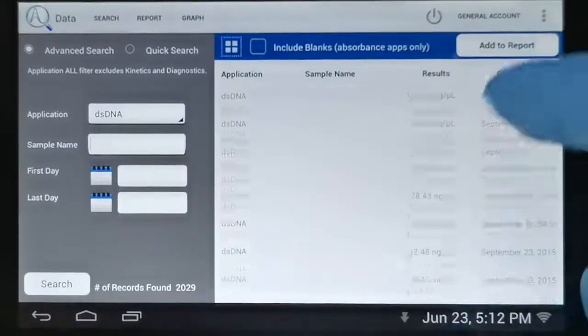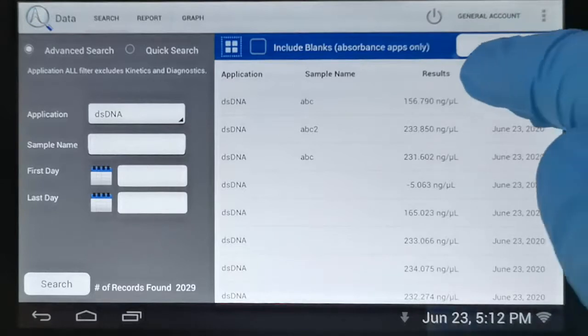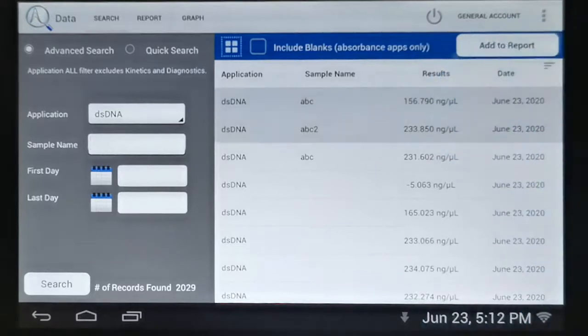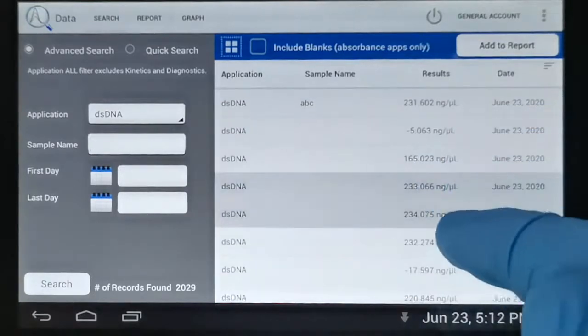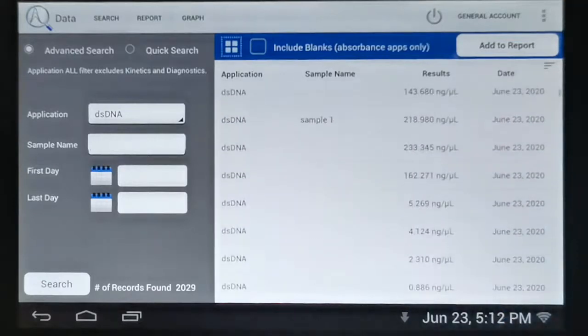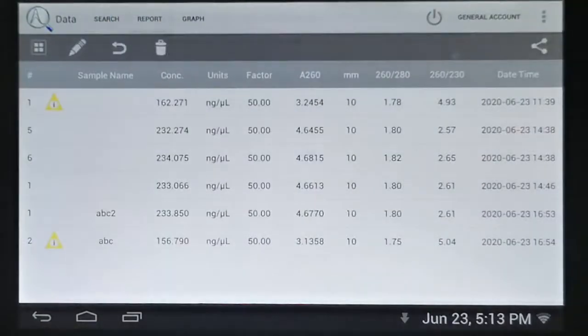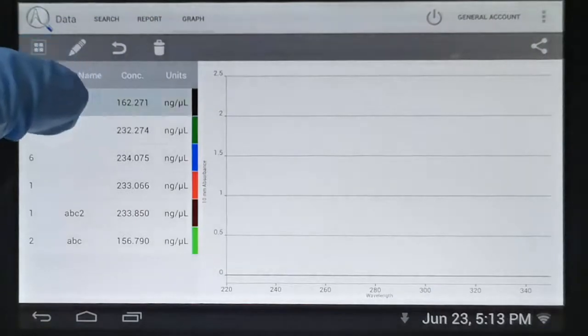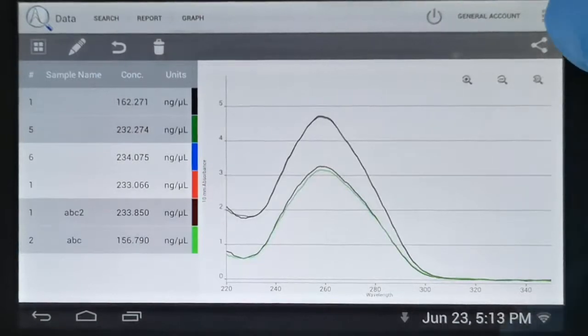If we move to the top of the list, or we can order based on any of the headings, we'll see that our data is presented here at the top. And we can select those and select some other samples that have been captured on previous days and simply add those to a report. If we go to our report tab, we'll see that all of that data is now presented in tabular format in the same way as it is in our count apps. And we can go ahead and overlay data that's been captured on different measurement sessions in a graphical way, and we can export that in the same way as we can for any of our measurement apps.